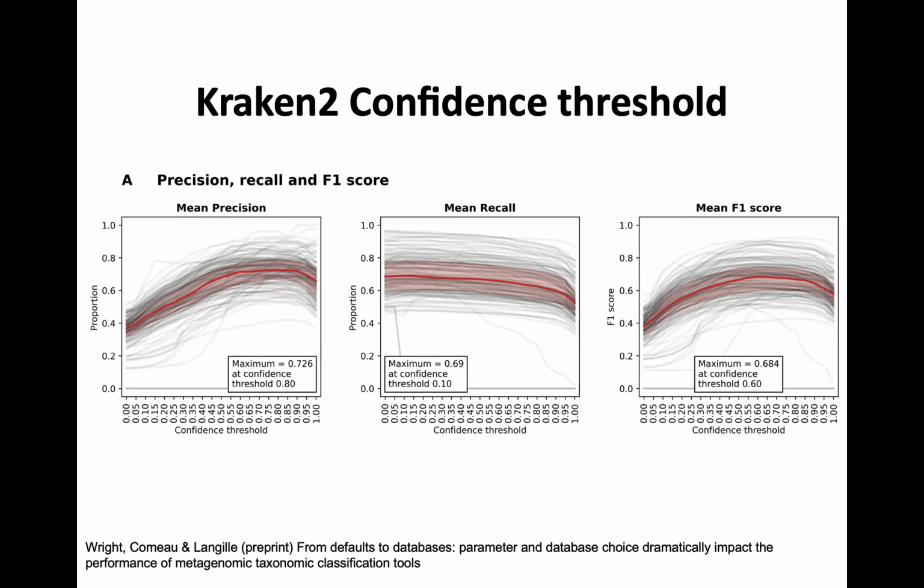Yeah, that's a really good point. Thank you. So just for people that didn't hear, basically there's a lot more complexity in environmental samples. The chance of hitting multiple reads to a particular taxa is less because you have a lot more diversity and less sequencing depth. And so Kraken only needs one read to say this thing's here, whereas MetaPhlAn requires multiple markers.